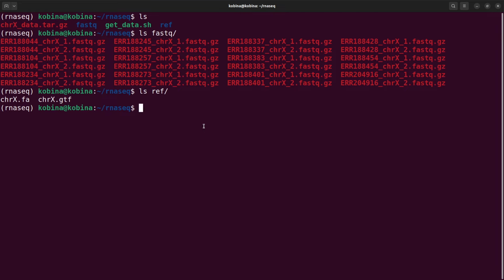So I can do the trimming, which is the one I have to do first. And of course, after trimming, then we will do mapping. We also have QC and stuff. So that means that in this script, I will start with trimming. In trimming, we are going to use Trim Galore. That's what we are going to use.